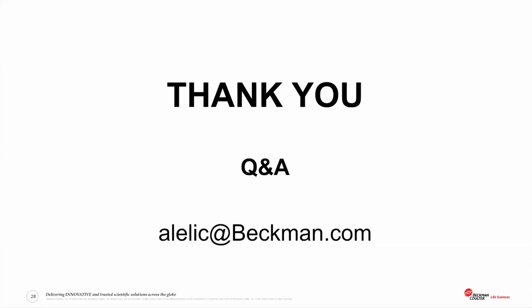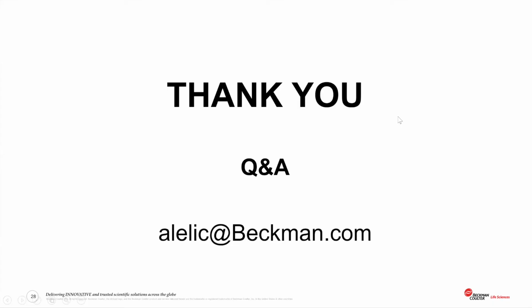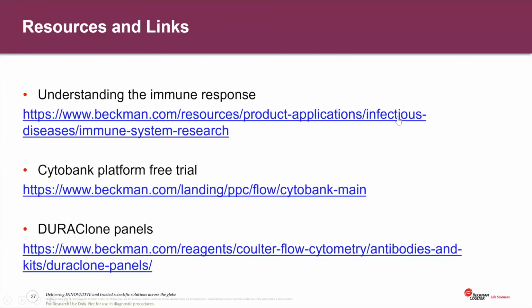Once you do the compensation calculation with your optimized settings, what you'll do after that is utilize your single color controls.